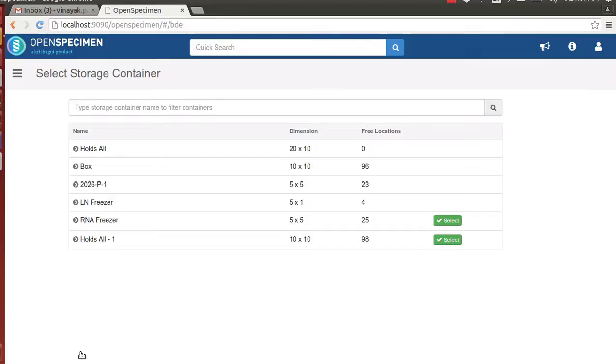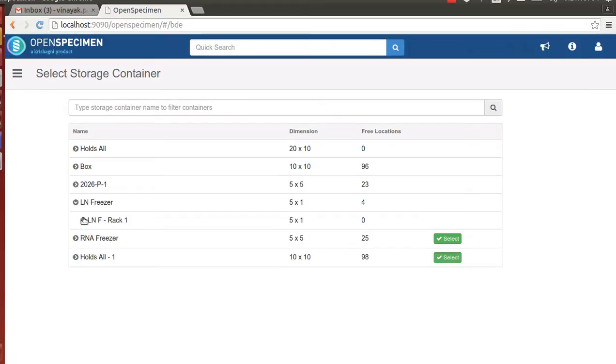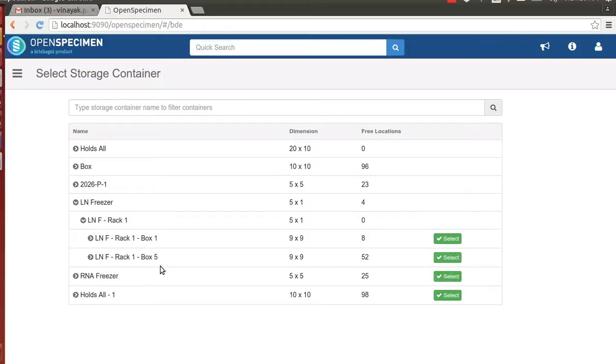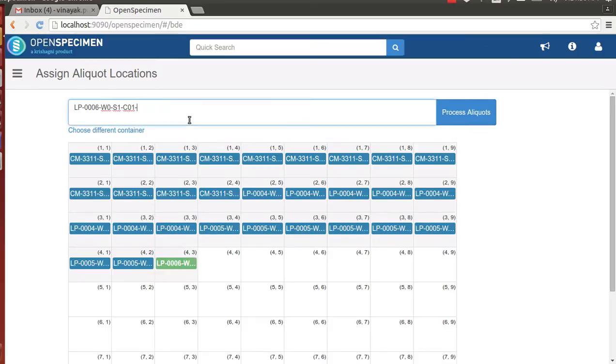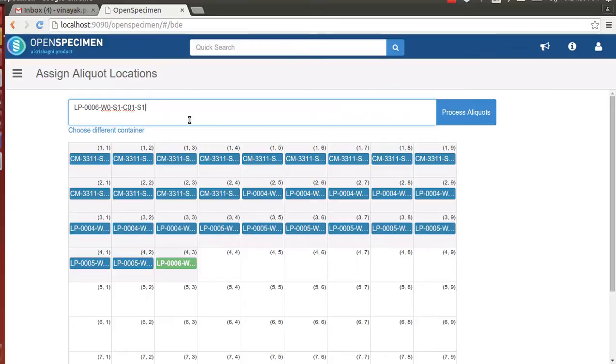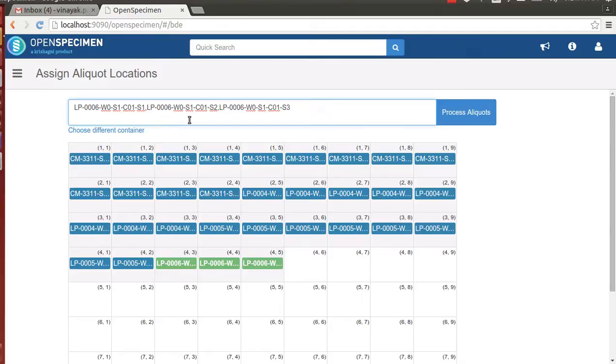Once the labels are printed, the technician can now select the container to store the aliquots. Let's store the aliquots in box 5, which has sufficient number of free locations. As the technician scans the aliquot barcodes, the positions where the aliquots will be stored are highlighted in green color.